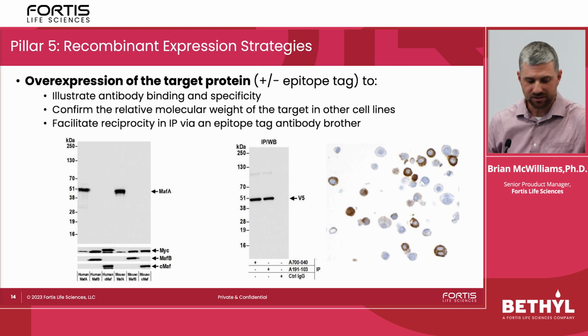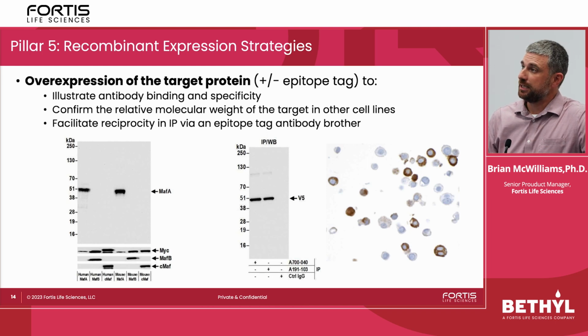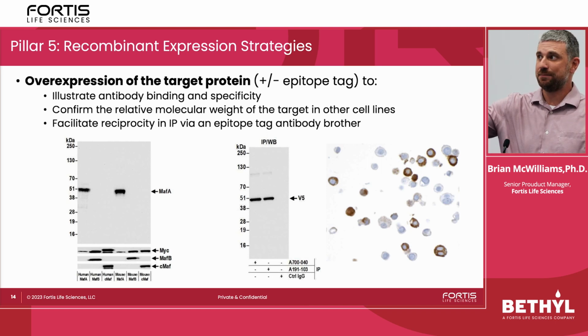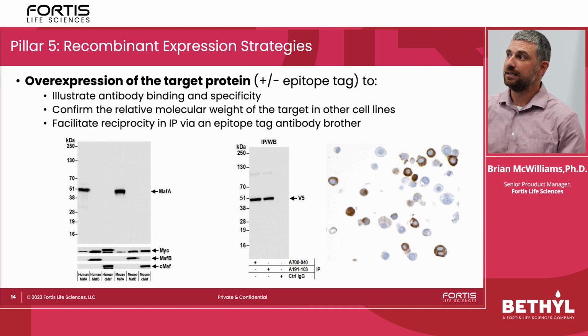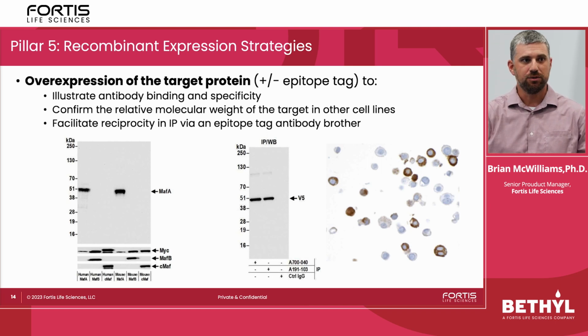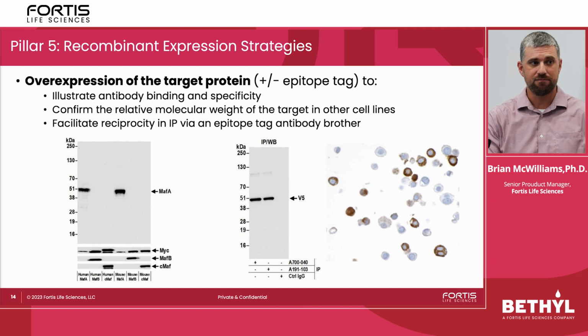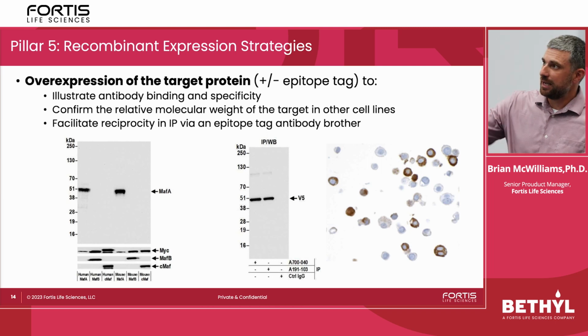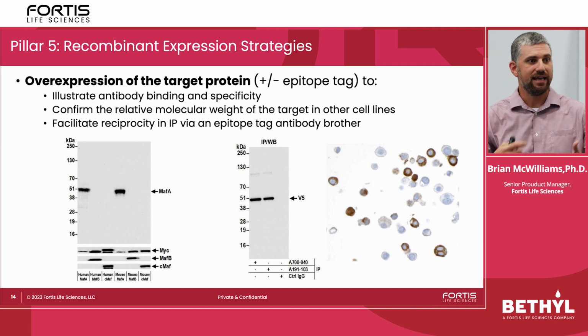antibody. Here in slide pillar 5, this is the recombinant expression strategy, and we will never ever only do this in a given experiment except in a very unique case like this. So in this case, we were looking at designing a MAF-A antibody, and we wanted to ensure that it was specific for MAF-A and specifically not binding to MAF-B or CMAF. So we created overexpressing cell lines for all 3 proteins, and then we're able to show our MAF-A antibody was only binding MAF-A, our MAF-B antibody was only binding MAF-B, our CMAF antibody was only binding CMAF, and then we have a MYC-tag control here in the center showing that, hey, there are cells in those lanes, we're just not seeing it with all of our antibodies.